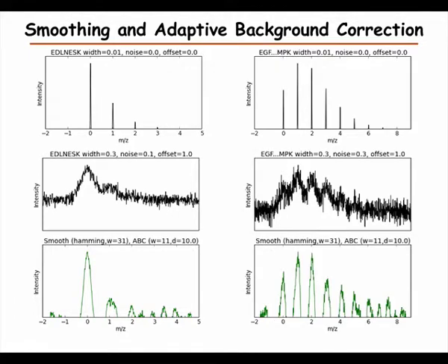And again, one more example of both noise and then we can apply a filter.